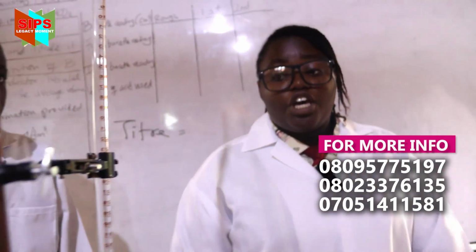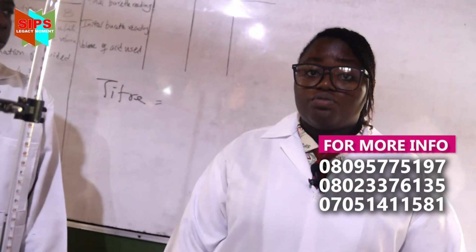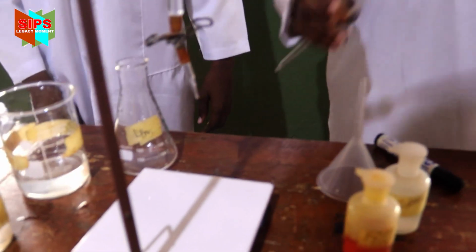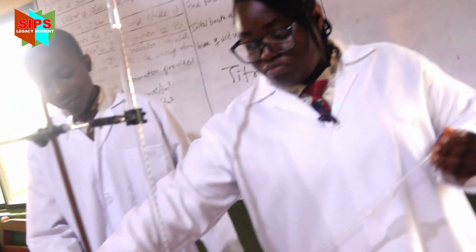Now he has put in A, which is the acid we are going to use today, hydrochloric acid, HCl. So next we pipette our base.